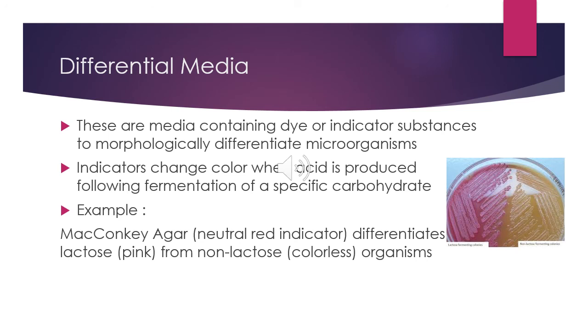The indicators change color when acid is produced following fermentation of a particular carbohydrate, and this is true for your Enterobacteriaceae family. A good example of a differential media is your MacConkey agar, which has a neutral red indicator, and it will differentiate the lactose fermenters appearing as pink colonies from the non-lactose fermenters, which will appear as colorless organisms in the solid media.